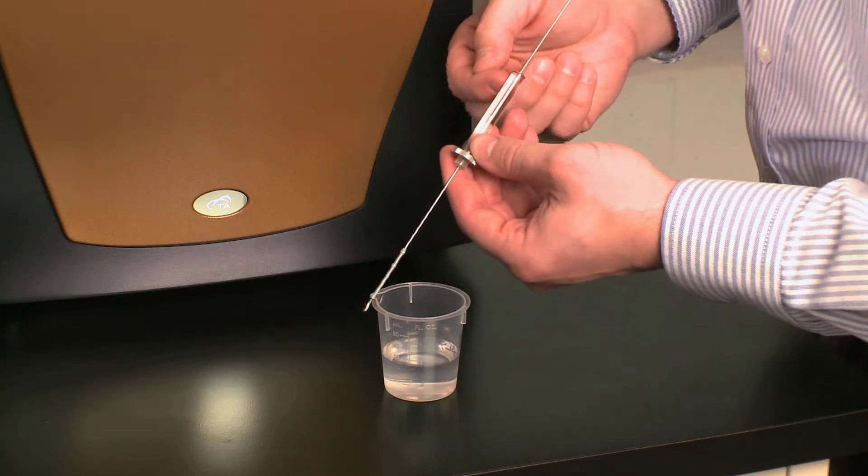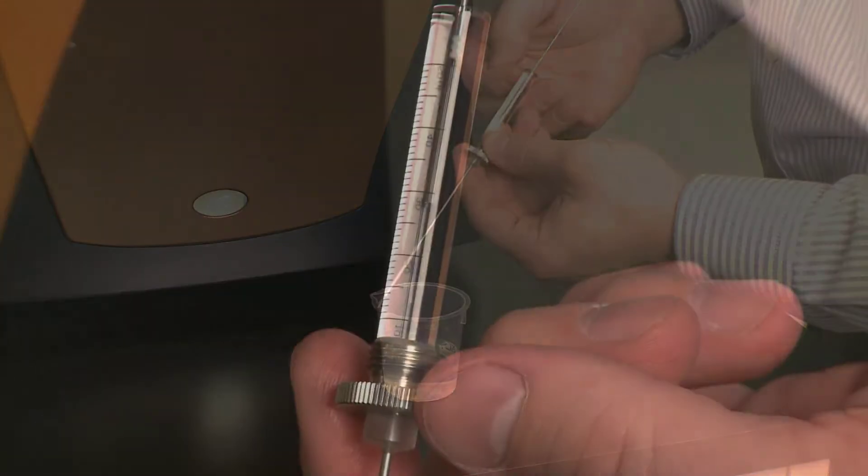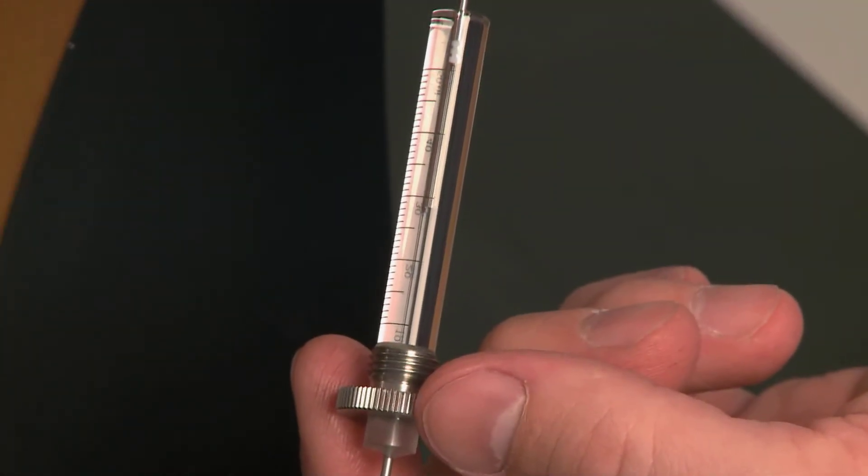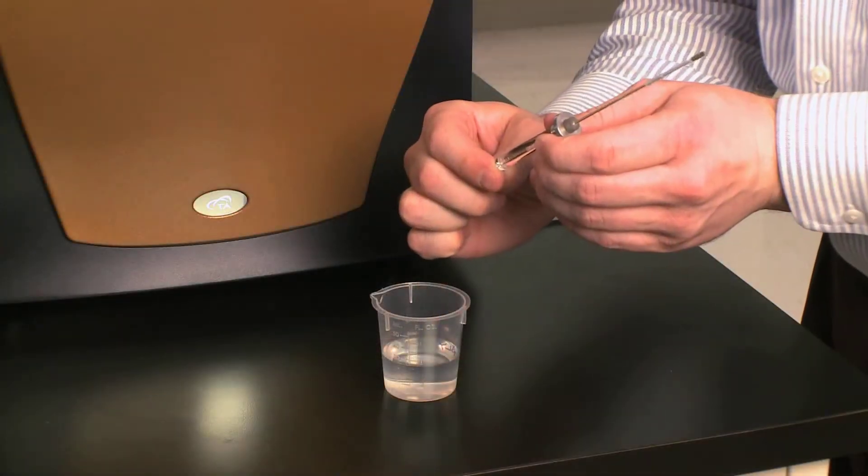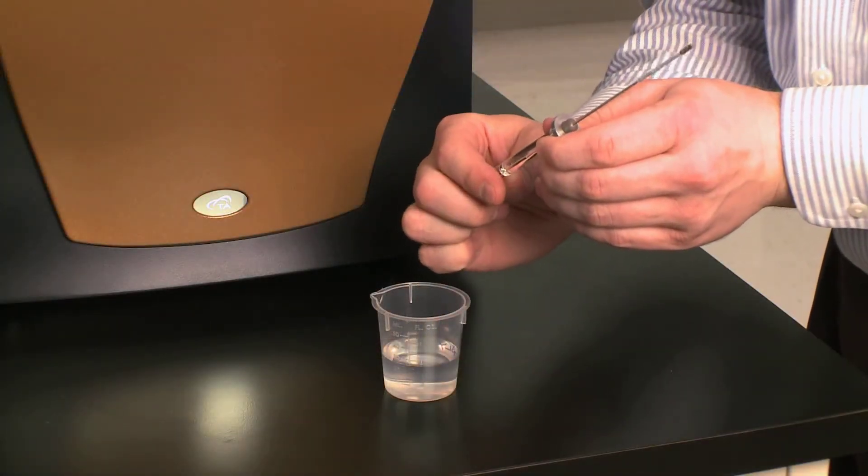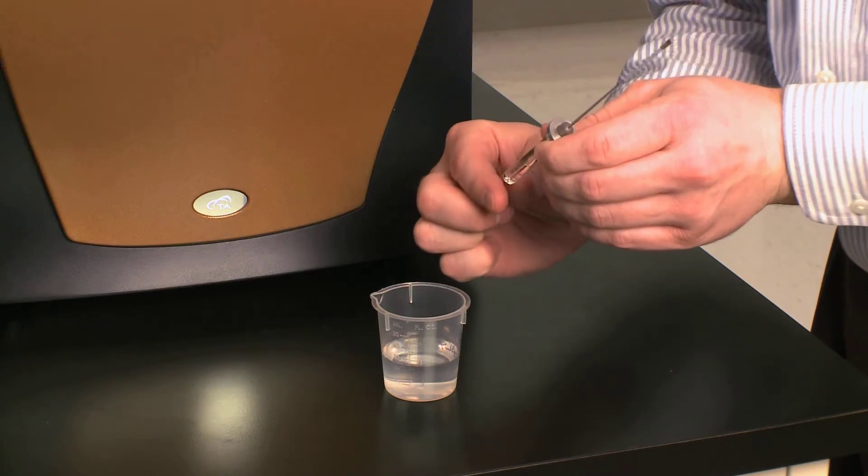And you see we have a big bubble between the end of the stopper and in the syringe. So what we have to do is tip it over and open the back end of the syringe and work out the water.